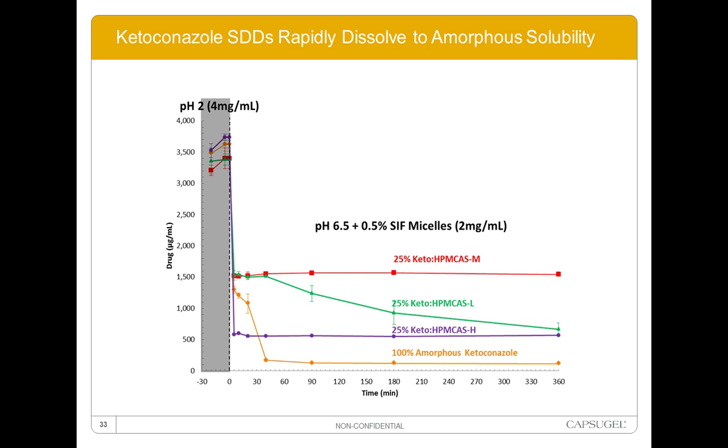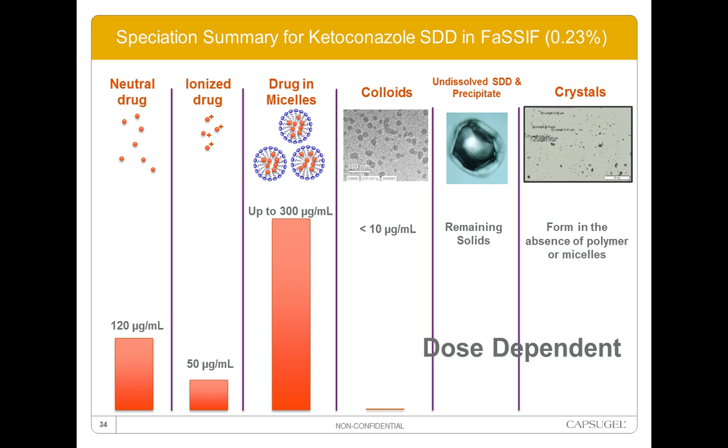And you can see here that the concentration of HPMC-AS-M is apparently much higher than HPMC-AS-H, and we don't observe any colloids by DLS in this test. So the question is, do we really have 3 times the concentration for the HPMC-AS-M formulation, or is it some smaller species that we're not picking up in DLS, or something else that's going on in this test that would suggest that the concentration is not really 3 times higher?